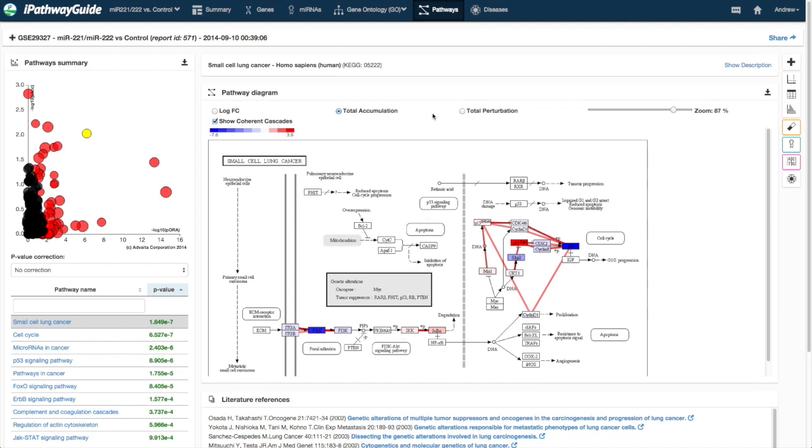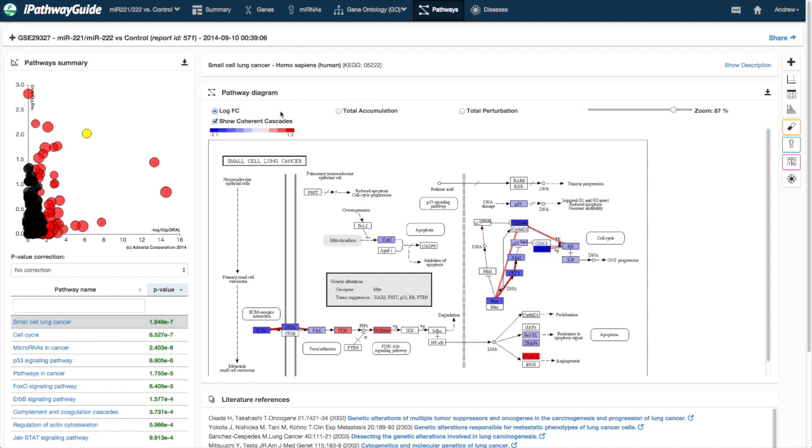The total perturbation of the genes in the pathway can also be displayed. The total perturbation is the combination of both the measured fold change from the experiment and the calculated accumulated perturbation from upstream genes.